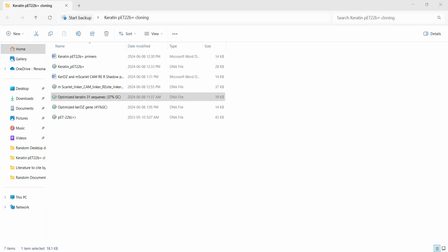This will be somewhere here. So Control C, your original sequence. Okay, it's here. So we go to add feature, BioBrick one. So if I remember correctly, we put the blue one. Then let's go to the one with the 5' end, which is Control C, and you search for that sequence here.